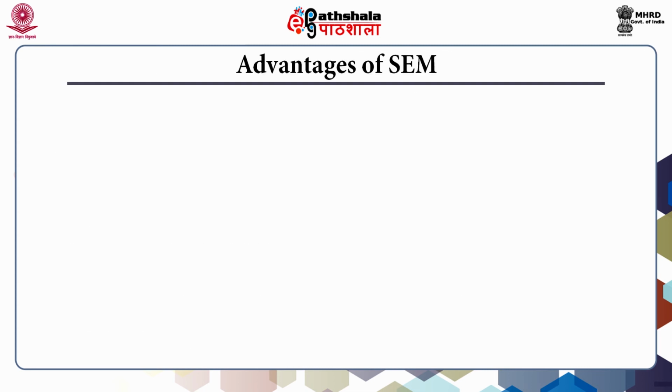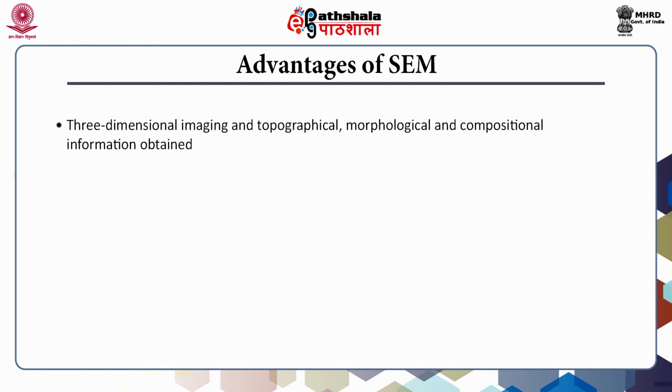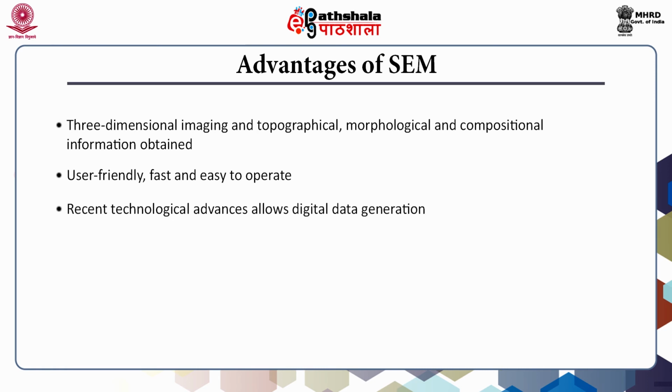Advantages of scanning electron microscopy are discussed here. Three-dimensional imaging and topographical, morphological and compositional information can be obtained with scanning electron microscope. The technique is user friendly, fast and easy to operate. Digital data generation is possible.